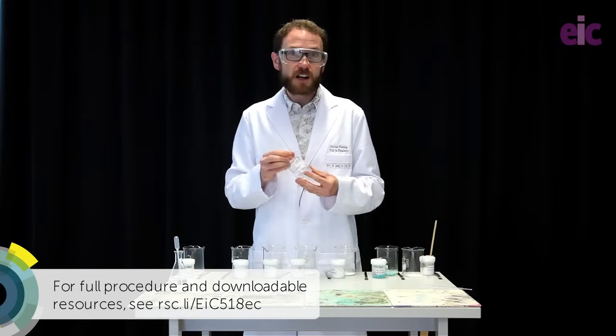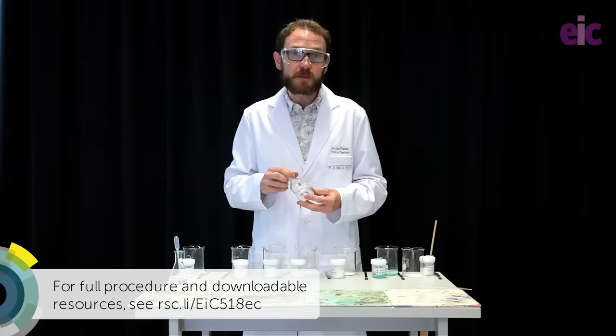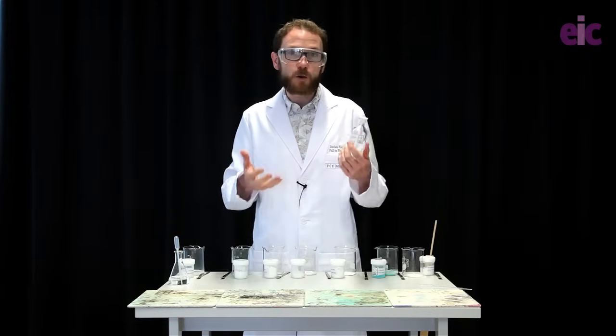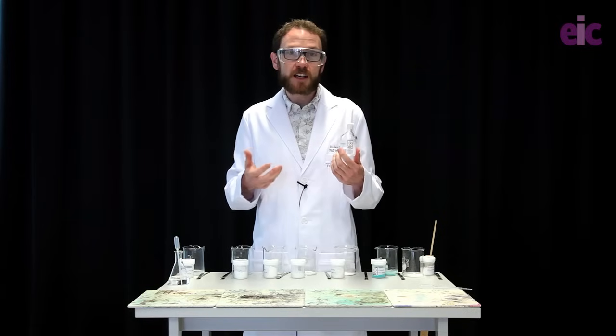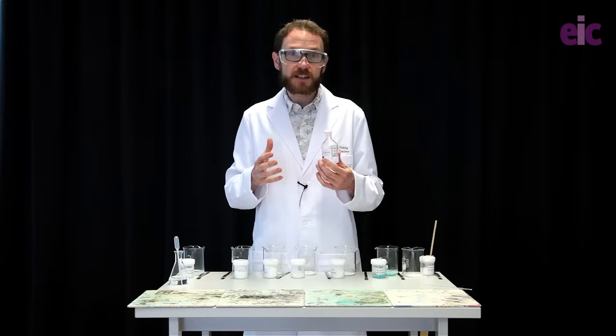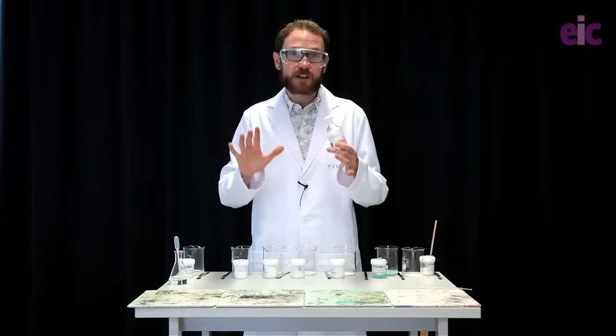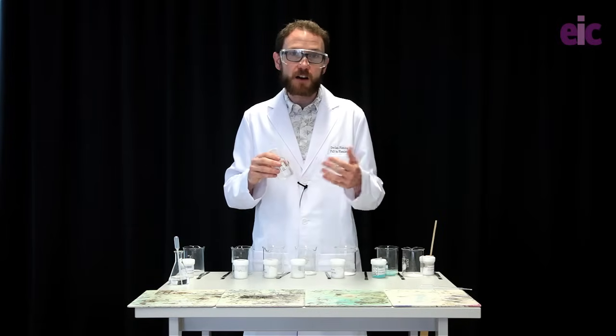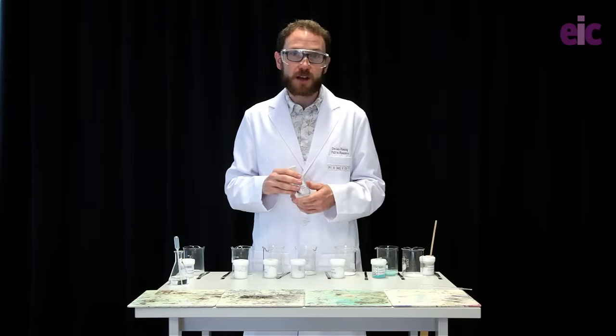I only need a maximum of 50 ml for this demonstration, so I'm not going to be bringing a whole Winchester load of ethanol into the lab. This is as much as I actually want to be around. And absolutely never, ever pour straight from the bottle onto the experiment after it's begun — we'll talk more about that later on.